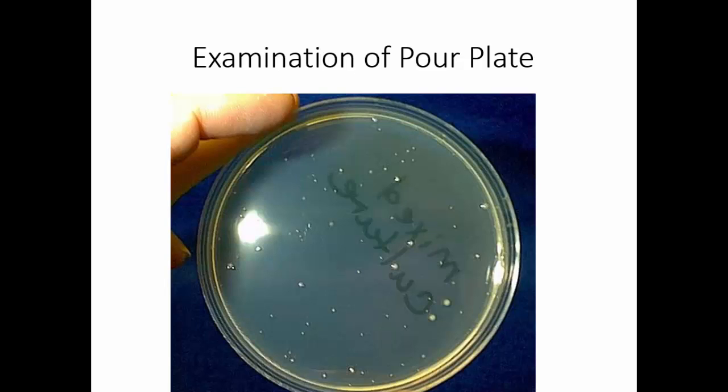As you examine your pour plate, you want to try to count the number of colonies. Some of the colonies will be on the surface of the agar. You'll be able to do colonial morphology on those, but others will be embedded in the agar. And those that are embedded in the agar will all have the same shape and size because they were trapped in the agar and couldn't grow freely.